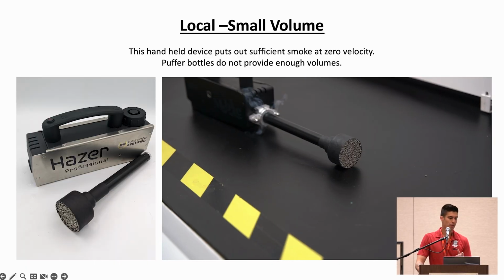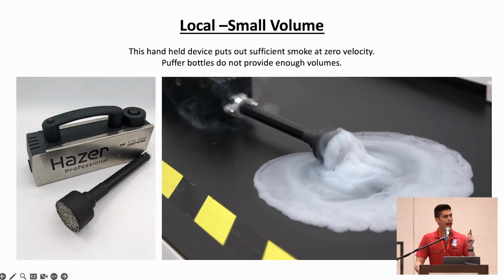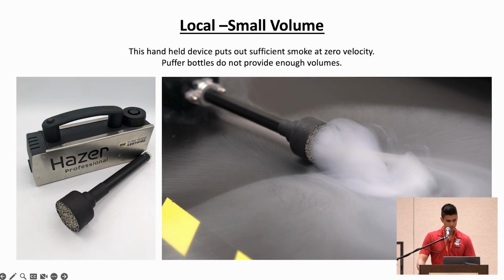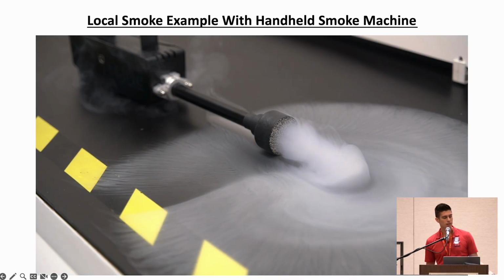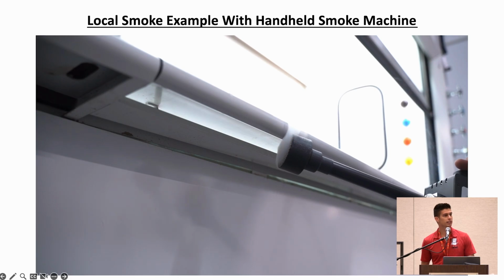And the kicker about some of these handheld units, you have to make sure you get one that has zero exit velocity. It's very important because look at this next slide here. Oh, wants me to play the video again. This is an example of what that looks like when that smoke just spills out, because air indeed behaves like a liquid, at least.